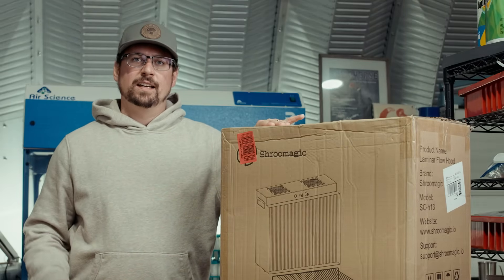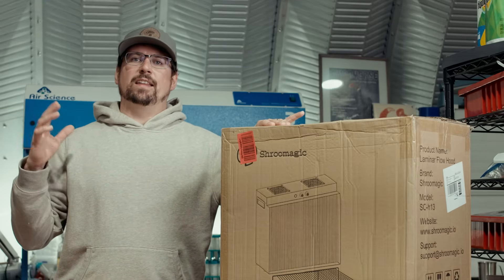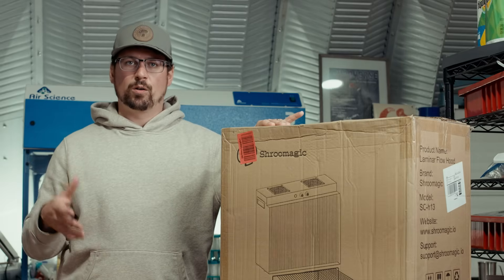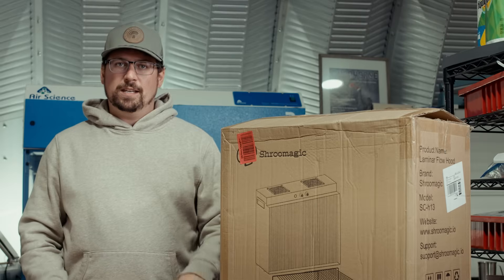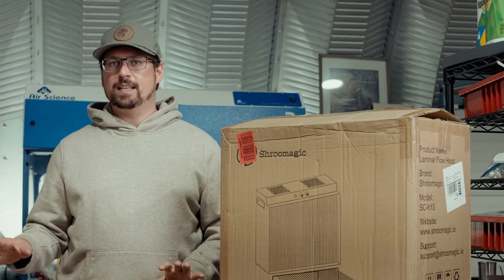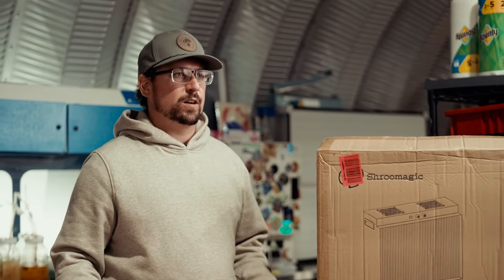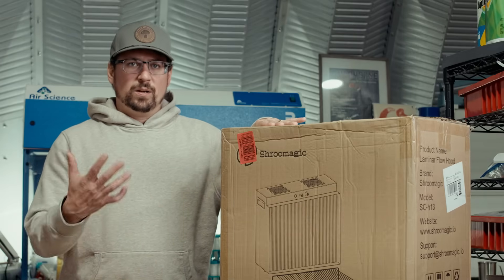I'm going to leave a petri dish open for about a minute, close it, and let it incubate for a few days. Ideally there will be no growth on that petri dish. If there's one to ten colony forming units or CFUs, there's probably a little cleaning that has to be done. Anything over 30 CFUs — I'm also going to do a plate at ambient just collecting dust from the room — means it's a dirty environment and we shouldn't be working in it.